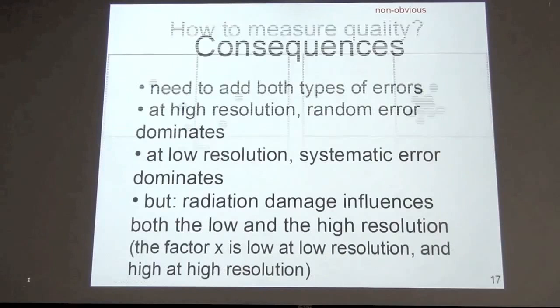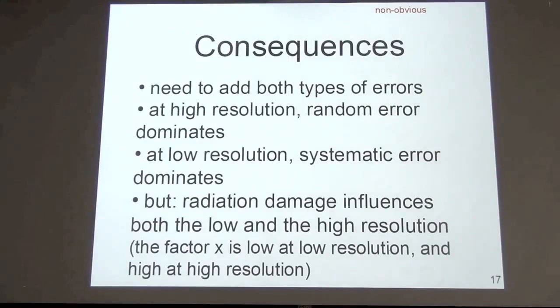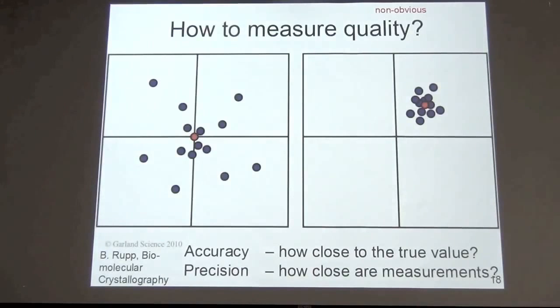Okay, going back, I think I tried to use the word quality somewhere. I know I failed. So when we talk about quality of data, what do we actually mean? Everybody seems to think of something different when we talk about quality. Quality is just a generic term. The correct scientific term in the natural sciences is to say we have either accuracy or precision. So quality is not the right word. We are always talking about accuracy or precision, as Jim already said, of course.